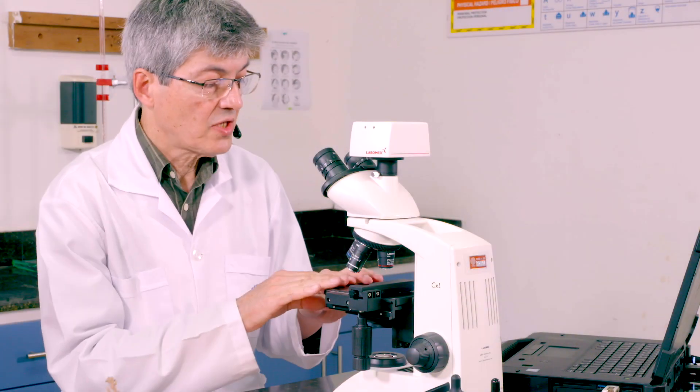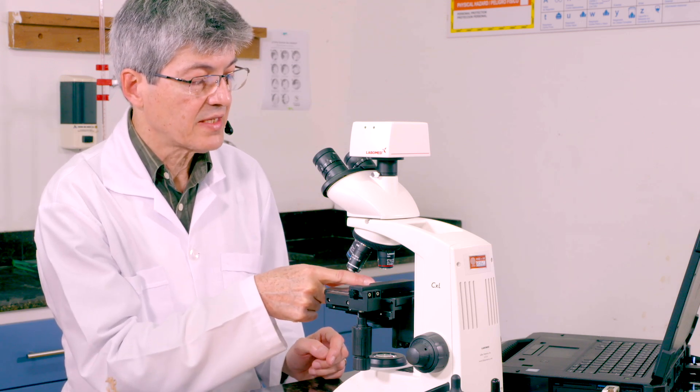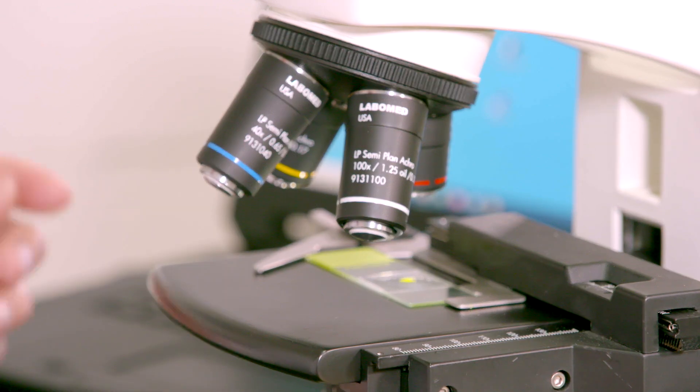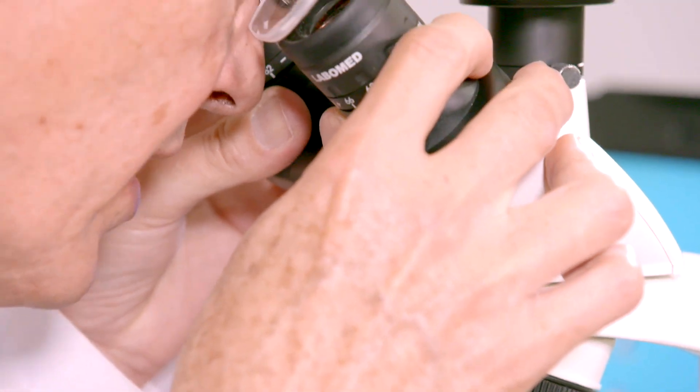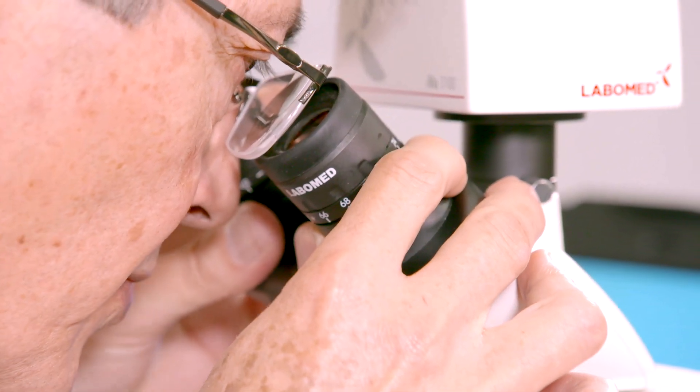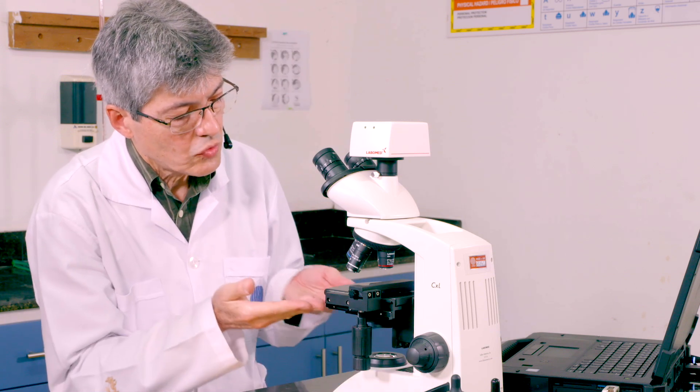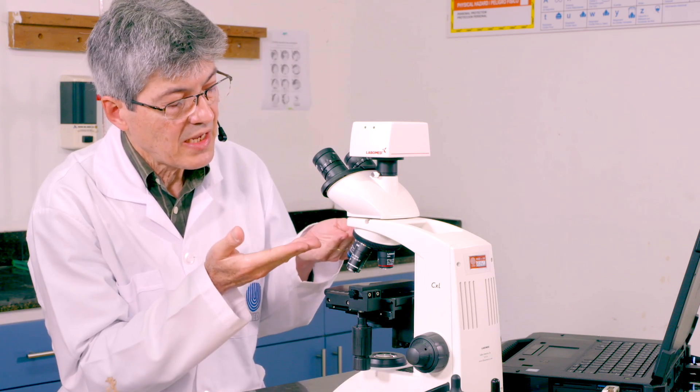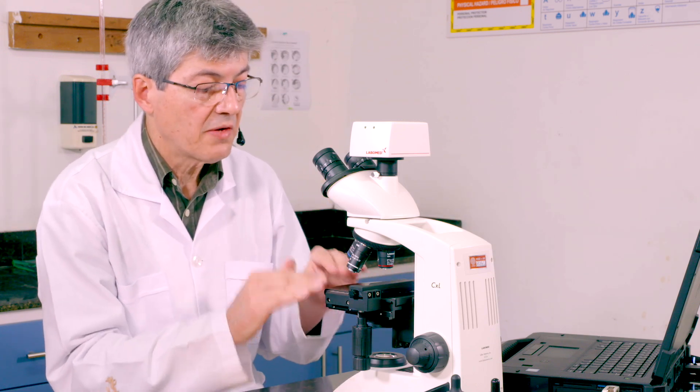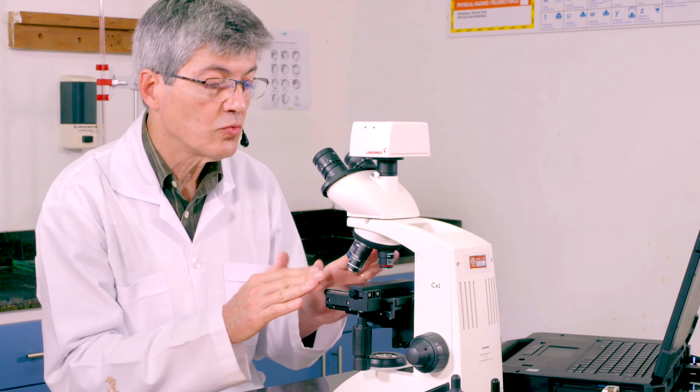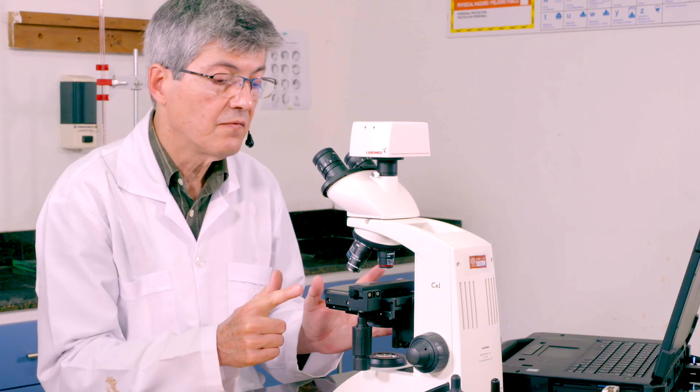Muy bien, nuestra platina tiene que estar abajo. Ya ubicamos la muestra exactamente en el centro, donde va nuestro haz de luz. Procedemos a ver, a adaptar los lentes oculares a nuestros ojos. Y ahí, con el macrométrico, yo voy a ir subiendo la platina hasta que yo vea una imagen más o menos nítida. Una vez que yo vea la imagen más o menos nítida, procedo con el micrométrico para enfocarlo.